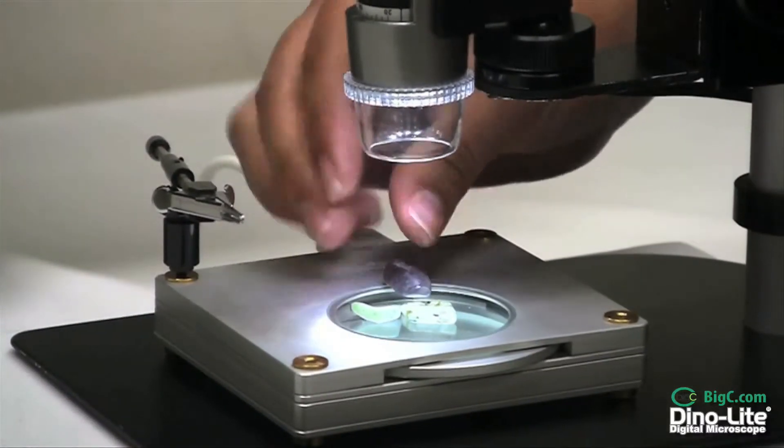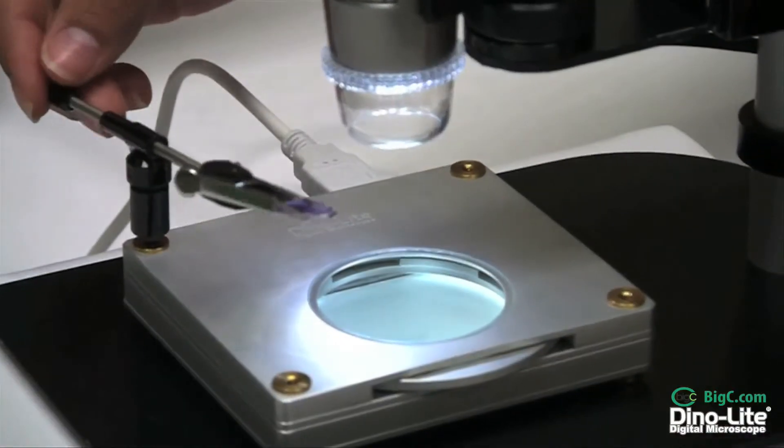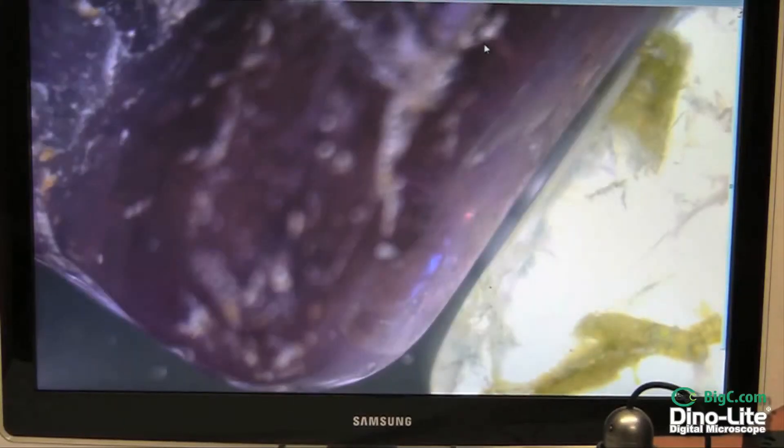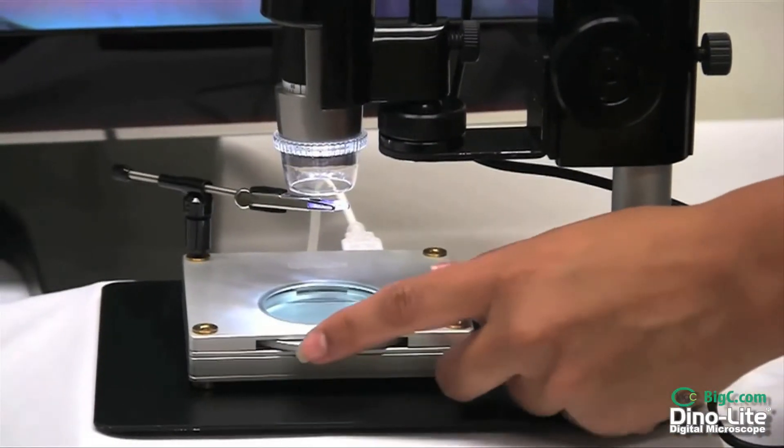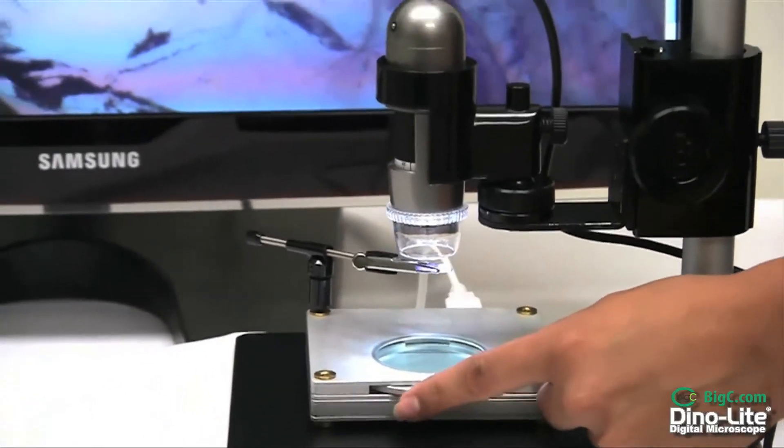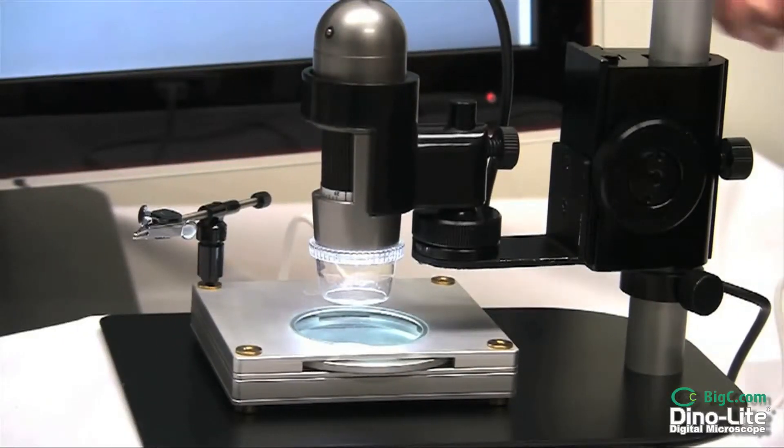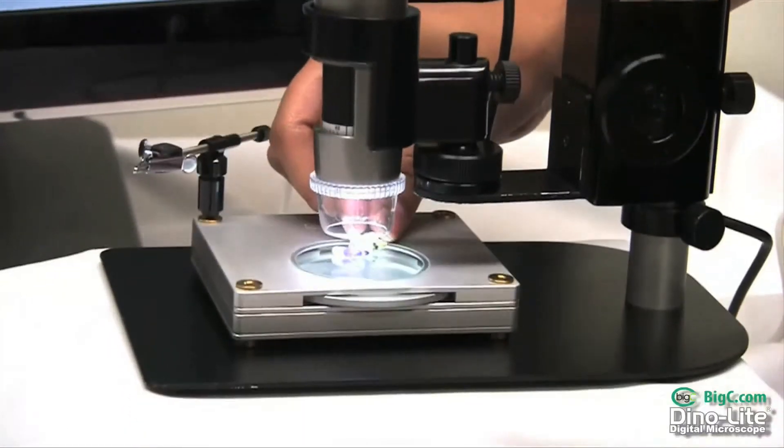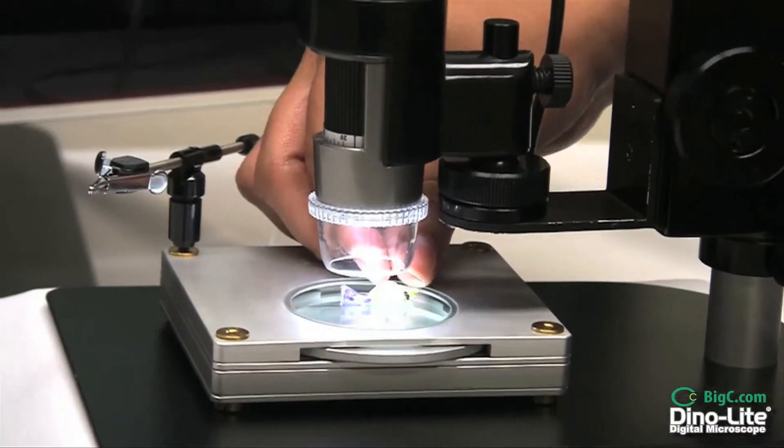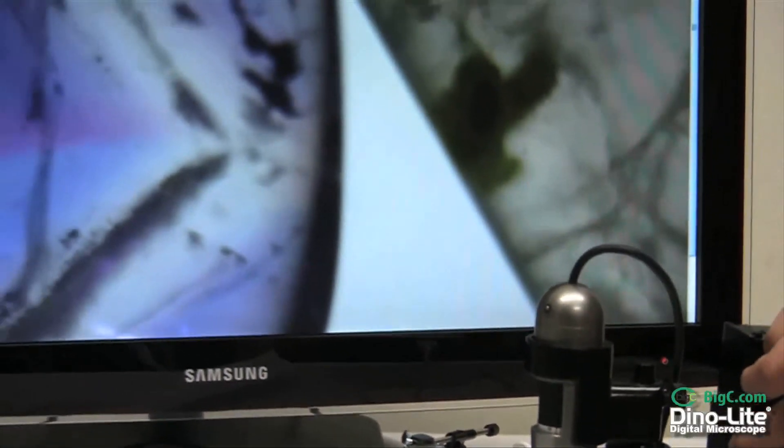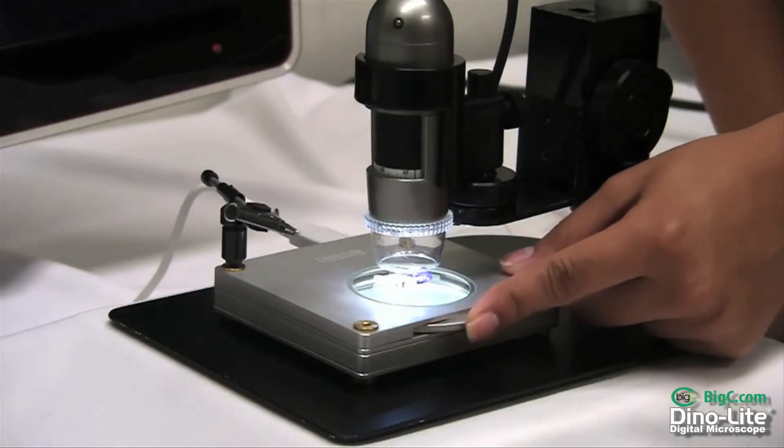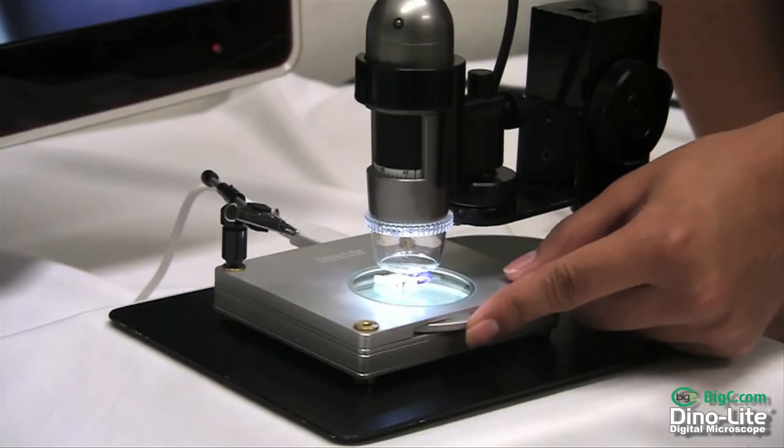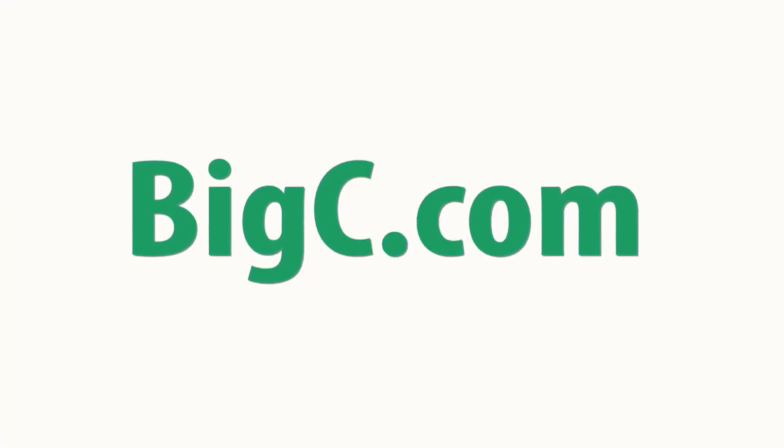This polarizing backlight is designed to work best with our polarizing scopes, which models include the AM413ZT, the AM413NZT, as well as the AD413ZT.